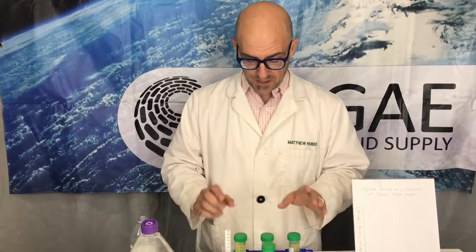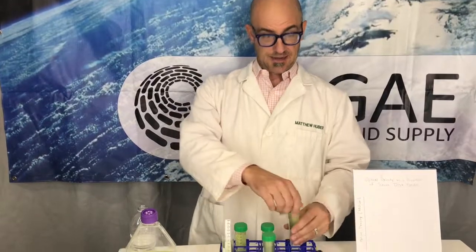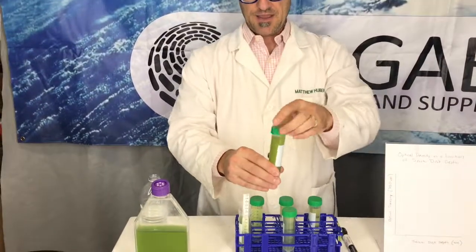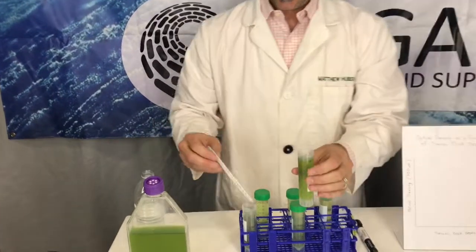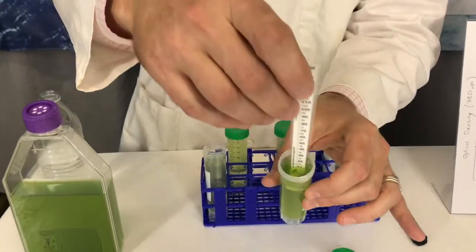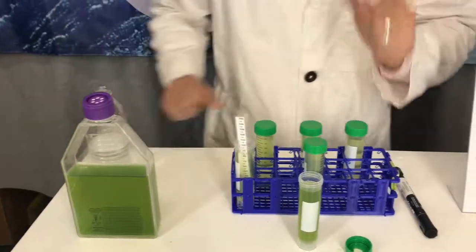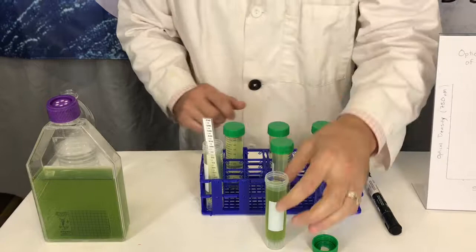That gives you a good estimate of optical density using the Beer-Lambert law. From this, you can do the same kind of work with a spectrophotometer, which again uses optical density. Start with a nice dense culture of algae like this one, and get your optical density from the same sample.